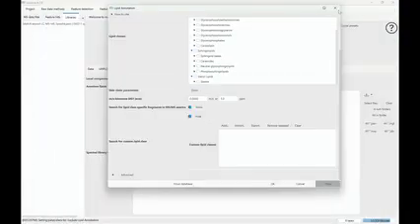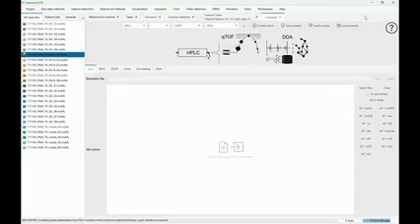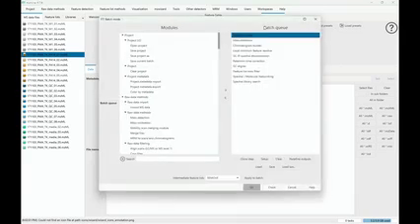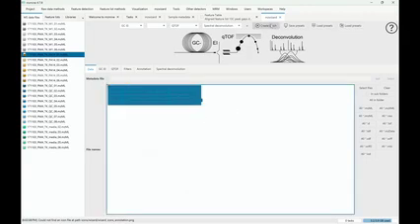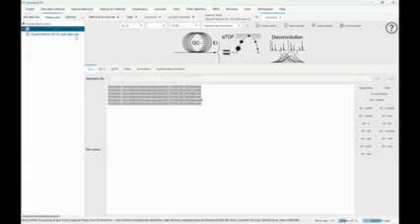So in here, one little thing, Corinna can already kind of come up. One little thing, you see I have some presets. I can always just load one of these presets, and that's usually what you would do in mzmine. You open the wizard, you load your preset, define the data files, create the batch and run it, and then we're going to just import some GCMS data, and it's also going to produce feature lists and annotations against spectral libraries. Of course, if you have GC-EI-MS, it's a hard ionization.